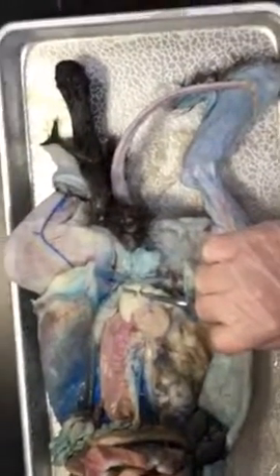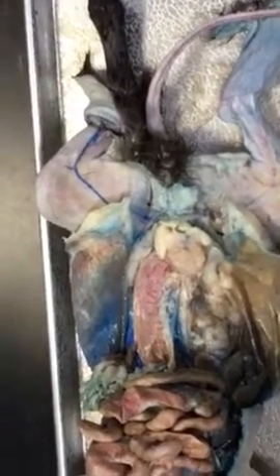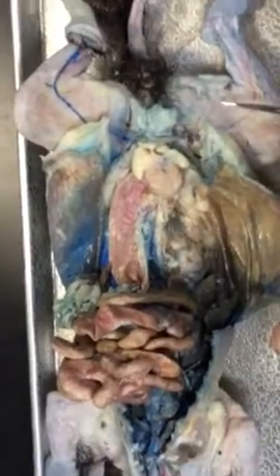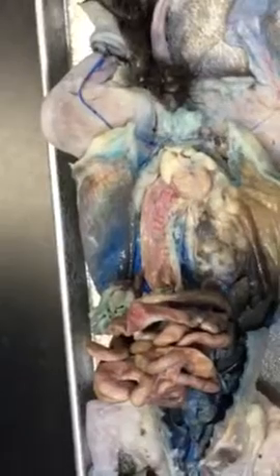That's great. Okay. Is that all of it? Urinary bladder, did that? And this one. Oh, peritoneum. Yeah. The peritoneum is the shiny lining of the abdominal cavity. Right, is that it? And that's when you get peritonitis, when it becomes infected, and that's not good. Because it's usually infected from leakage from the intestines.